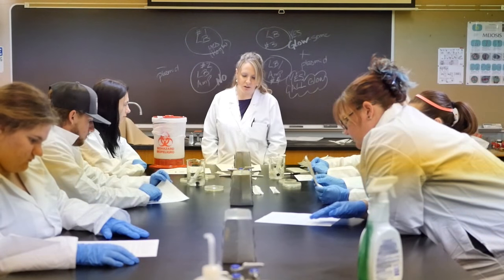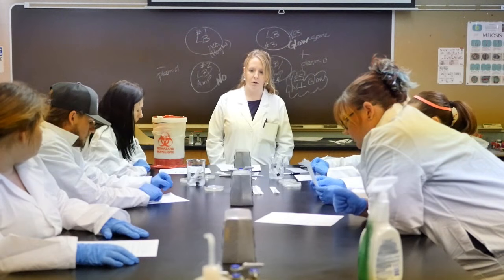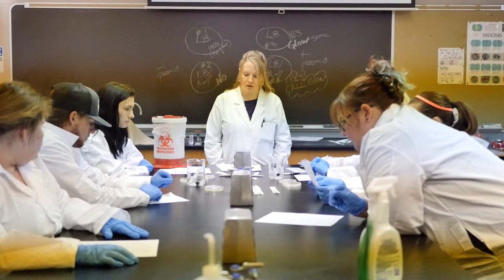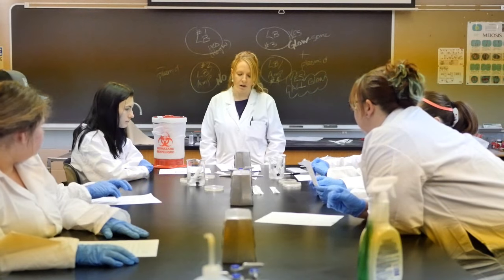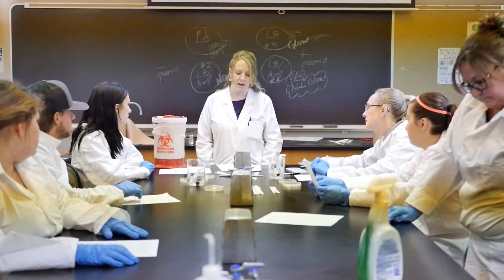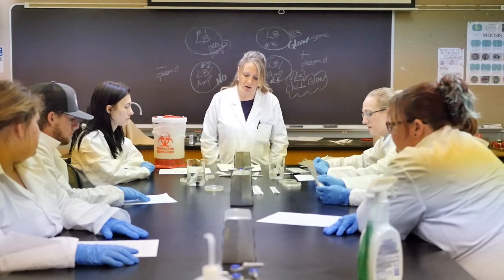You're going to add in 250 microliters of that, the same measurement as the calcium chloride that you put in from before. So the exact same way, you measure it, put it in there, mix it up. To mix it, you just use your finger to tap against the side, and that will agitate it enough to get it mixed up. So that's the next step.